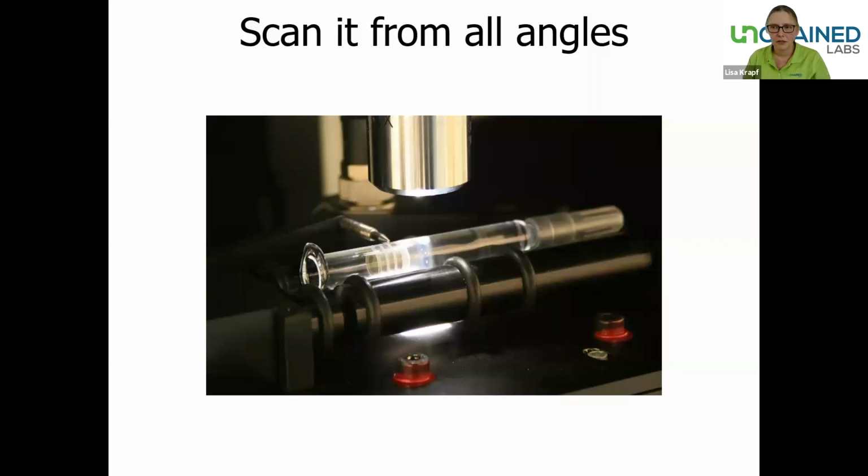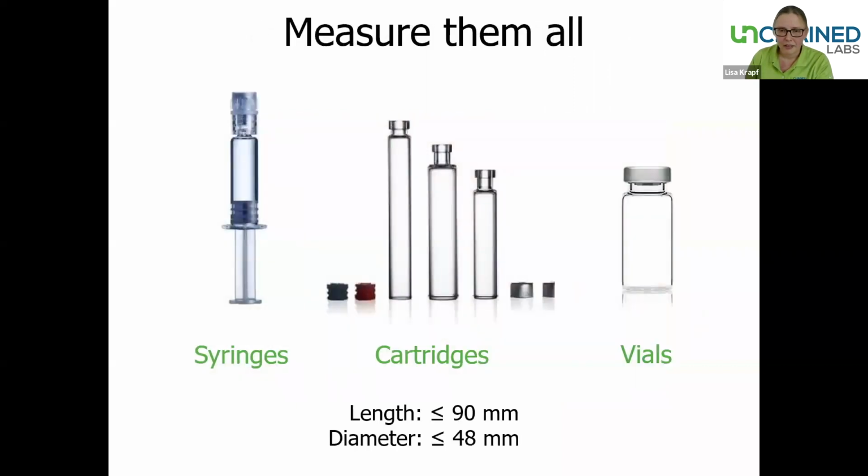When we have measured that whole line along the syringe, we can rotate the syringe by a user-defined angle and then measure the next line, with a different angle. We will do that for a few lines, so you can measure up to 36, and then you have all the layer thicknesses at all the defined positions in the measurement. And thus you get a distribution of silicone inside the syringe.